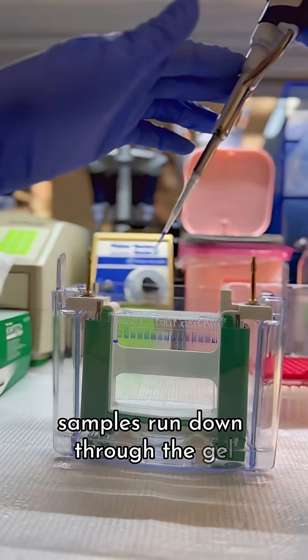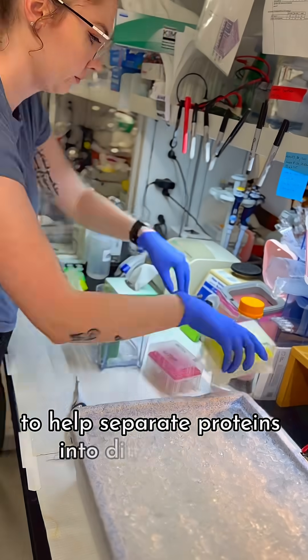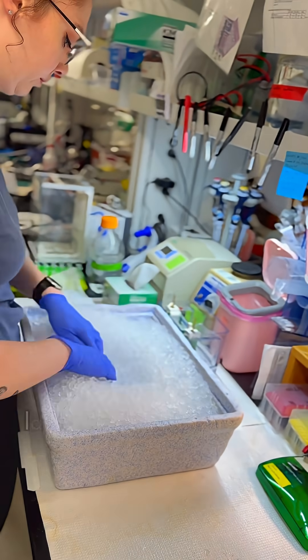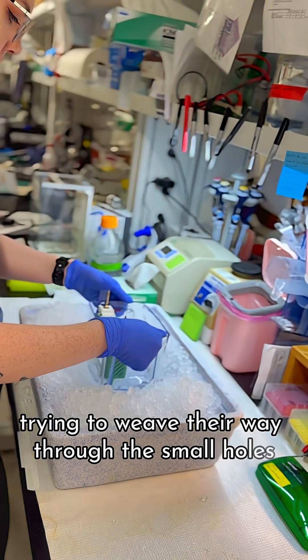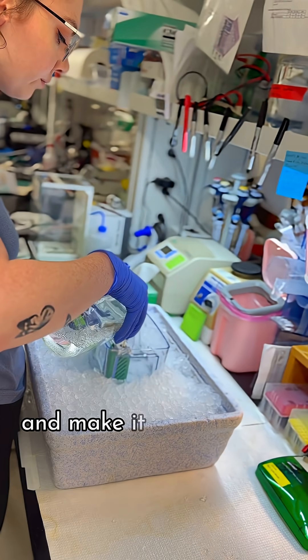Samples run down through the gel using gravity and an electrical current to help separate proteins into different sizes. Gel is like a sponge — it has many small holes. Larger proteins get stuck closer to the top, trying to weave their way through the small holes, while smaller proteins have an easier time navigating the holes and make it closer to the bottom.